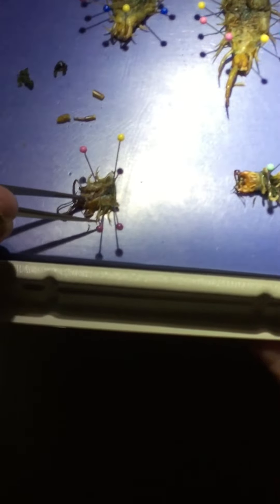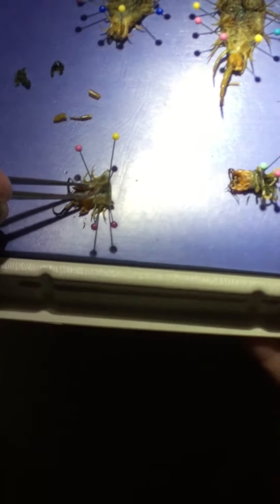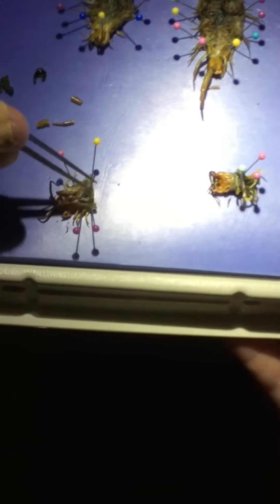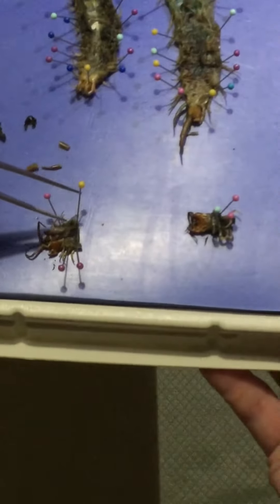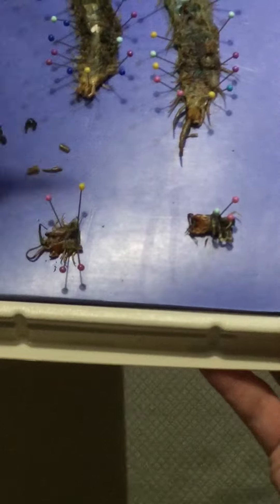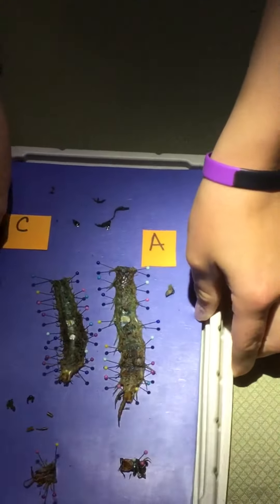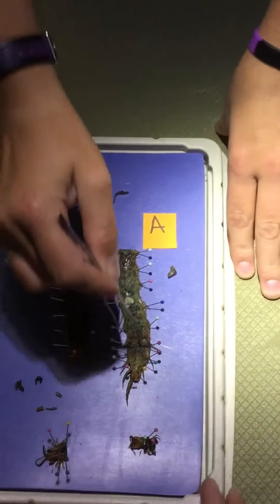My mom — or I — had accidentally cut the brain open, sorry, but this is inside the head. It's kind of gross. Right here is the Eritura, and at first we thought it was like the gut or the dome.